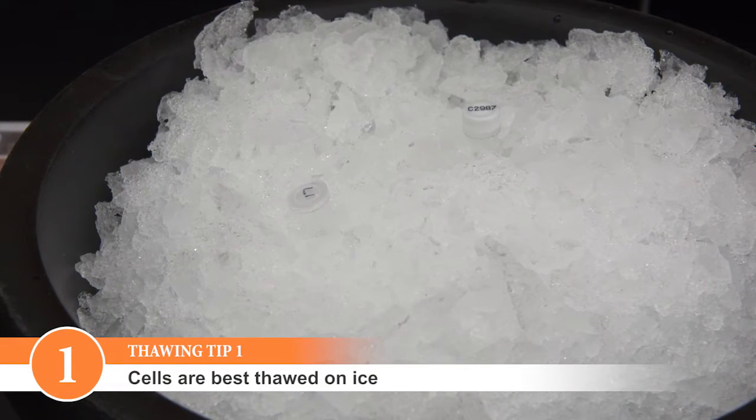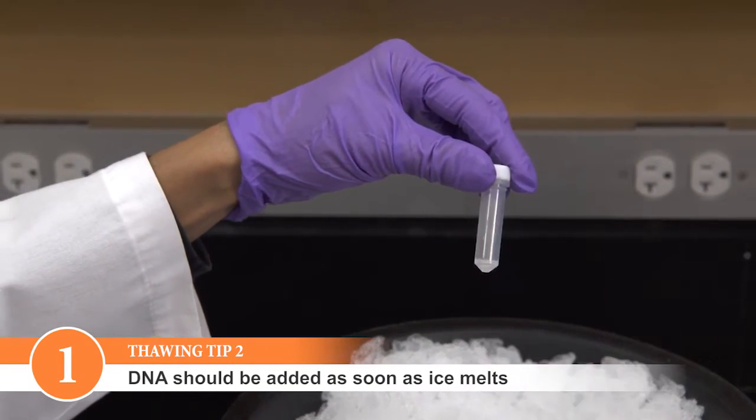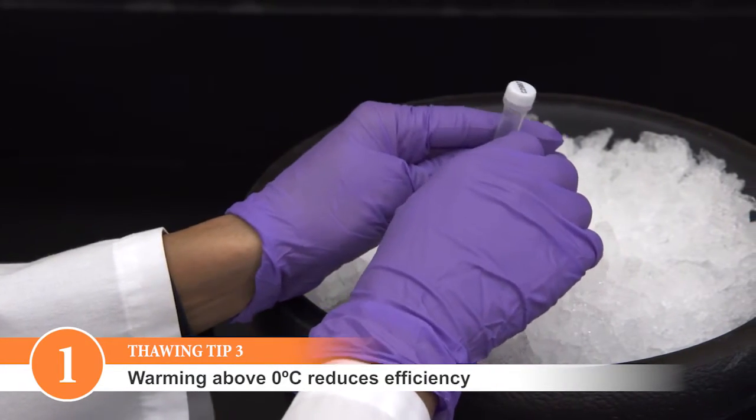Cells are best thawed on ice. DNA should be added as soon as the last trace of ice in the tube disappears. Cells can be thawed by hand, but warming above zero degrees Celsius decreases efficiency.